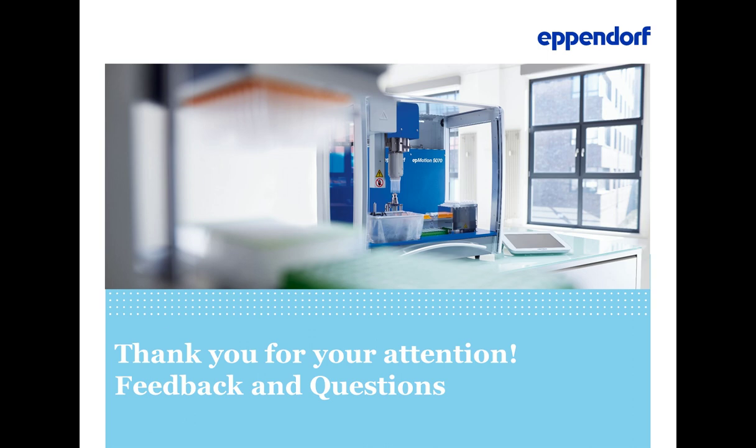Tim, our first question, and this one has come in a couple times, is there any way to speed up a PCR?